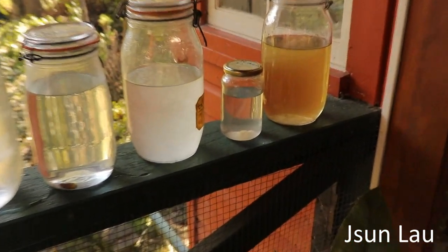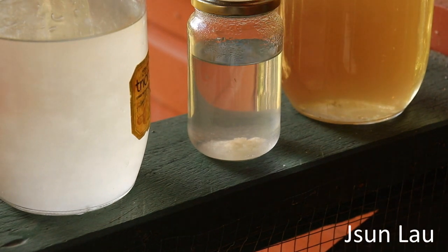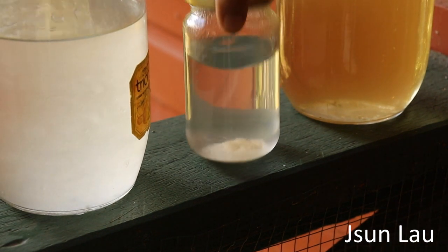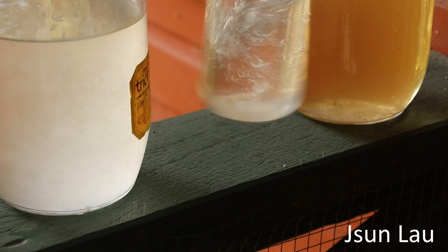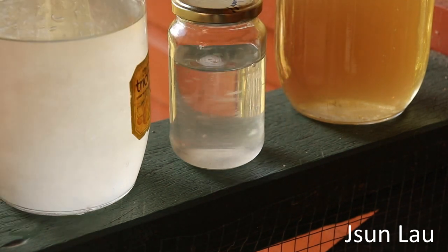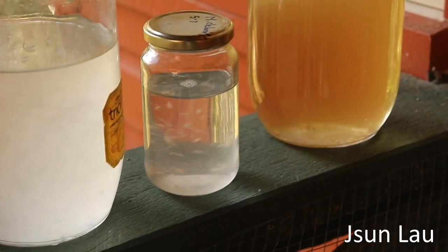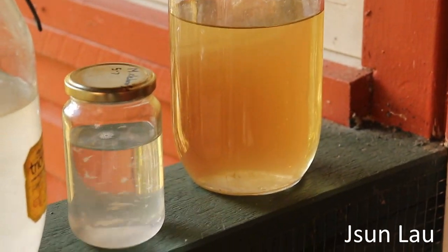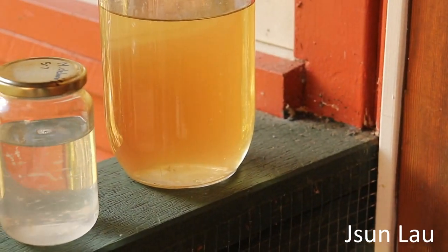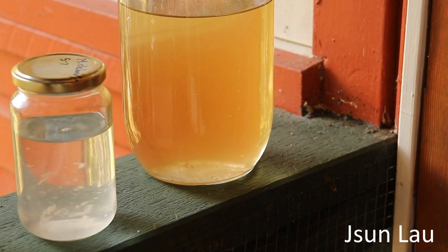The little jar there is a native parasol mushroom — a little Lepiota from spore. The spore has germinated and there's a little bit of mycelium. And this one is about a week old, grown from a piece of dried porcini.